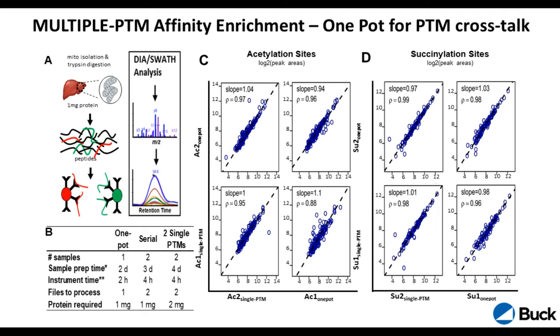In fact, I'm showing this to you here. If you do a serial enrichment, where you take the leftover of the acetylation enrichment and use it for the next workflow, it doubles the time. Or if you even start from two separate sample sets, two separate tissue sets, it also increases the work that you have to put in, or the research associate or postdoc in the lab.